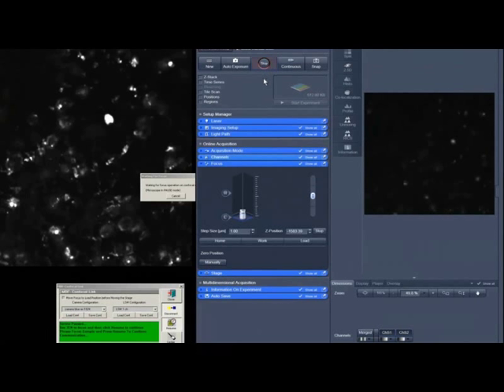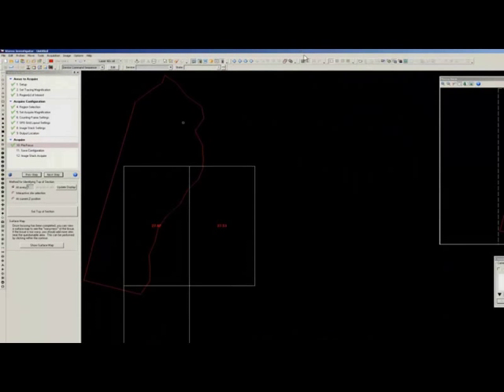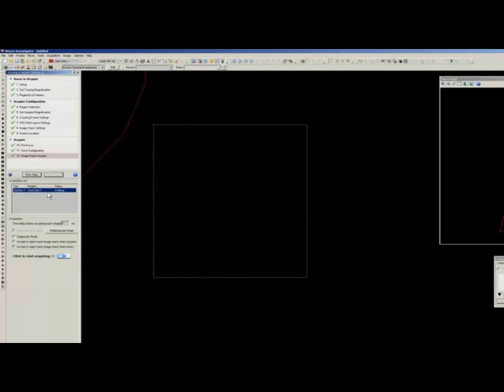Yep, so you're just going to toggle back and forth, but the best part is that Stereo Investigator and Zen know when they're each supposed to play a role. Correct. It's seamless. And so the data from Zen that you just dictated by setting the top of the tissue gets ported into Stereo Investigator, and a topographical map is generated. We can then save all of the configuration settings that we've generated in Stereo Investigator for future use.